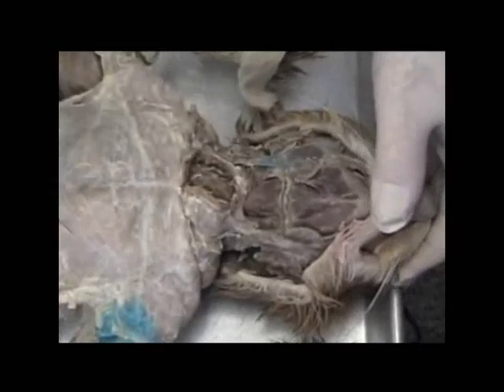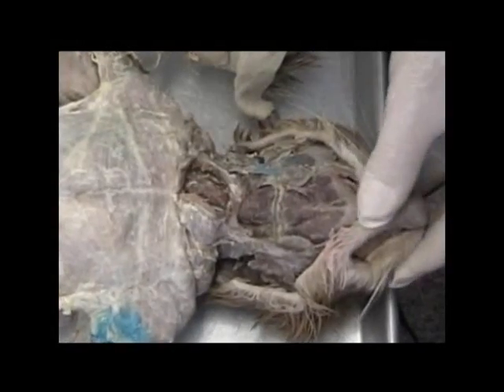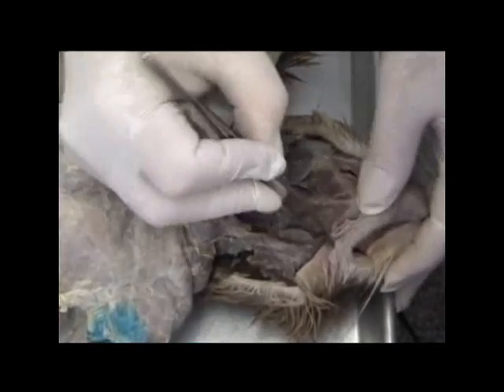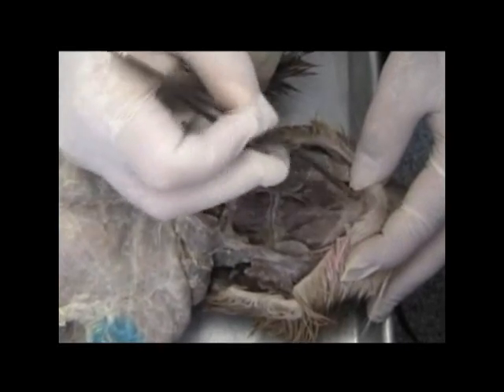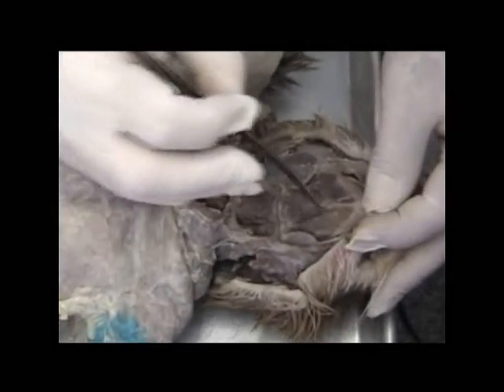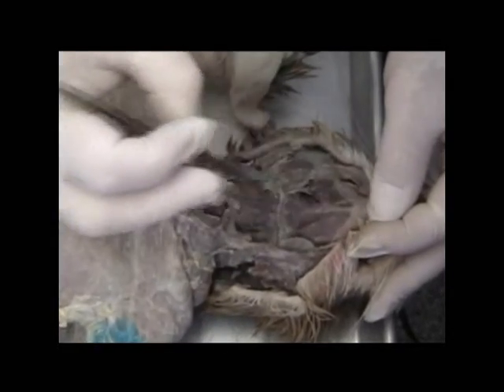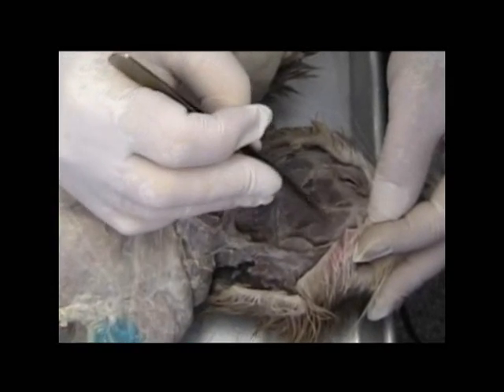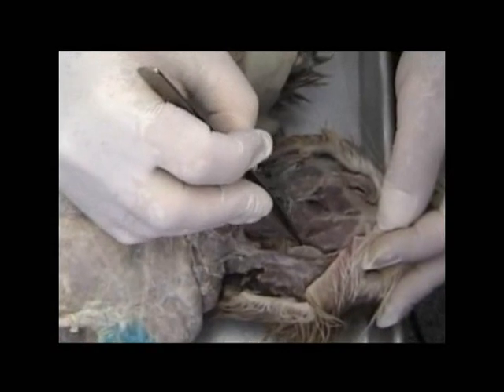Okay, let's begin the review by taking a look at the muscles found underneath the chin and down into the neck of the animal. And looking for landmarks, the first thing we see here is the actual mandible itself. Hard, you can feel the bone. And we see a pair of muscles that run up toward that genu of that mandible. We see that the fibers on those muscles run this direction. These two muscles here are the digastrics.